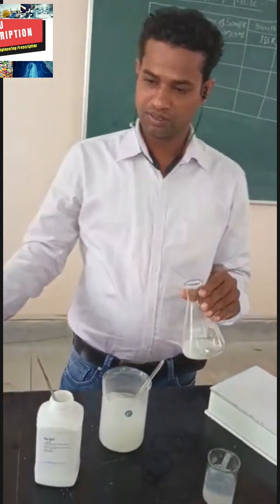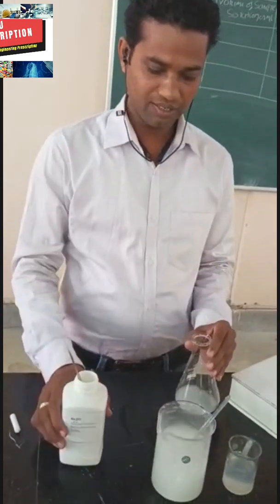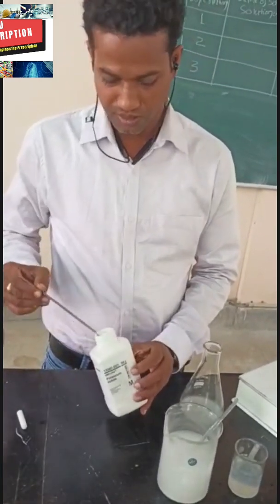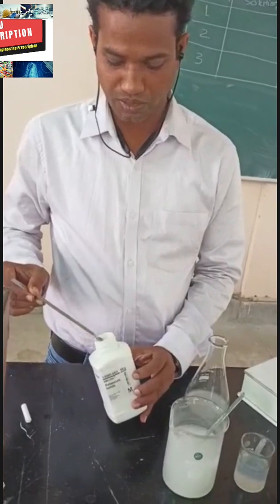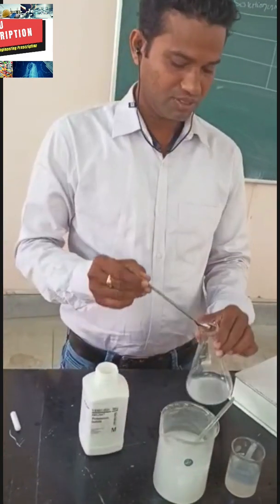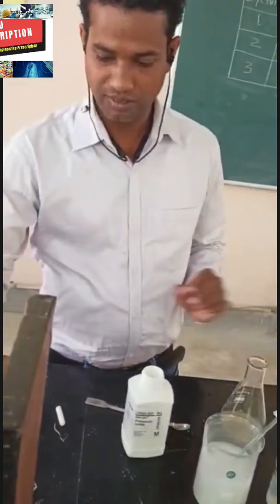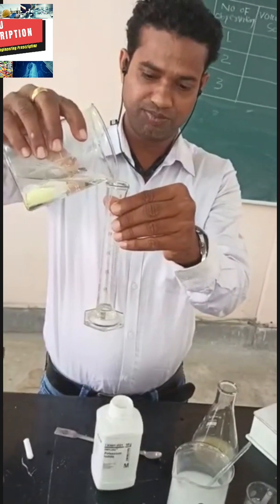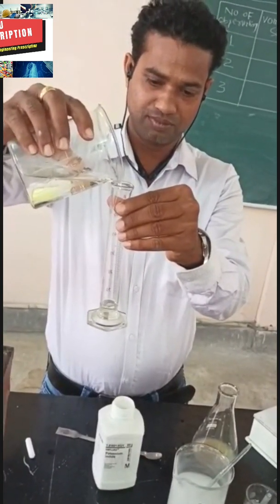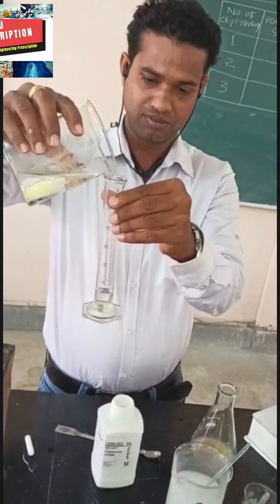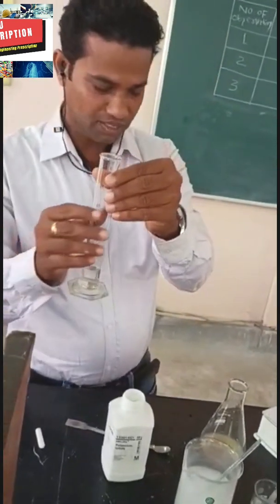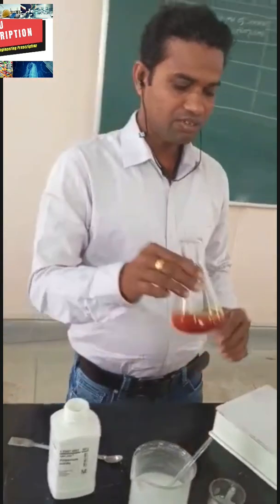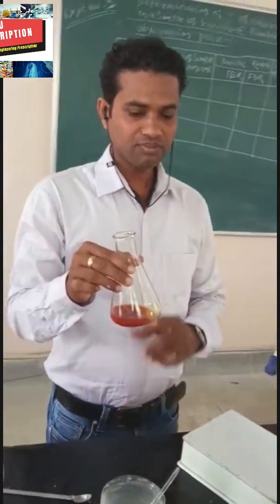We add 1 gram solid potassium iodide and 10 ml glacial acetic acid. This is potassium iodide. Now we add approximately 1 gram solid potassium iodide, and then measure 10 ml of acetic acid. Now it is 10 ml — add to the conical flask. Now here iodine is liberated.